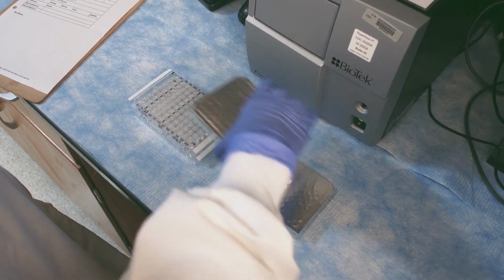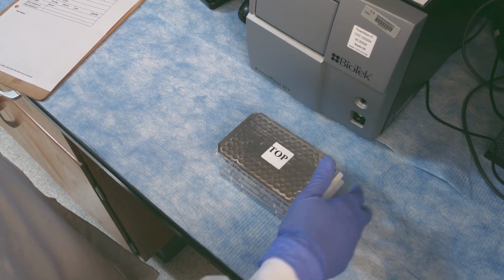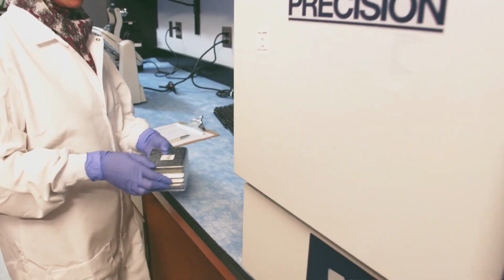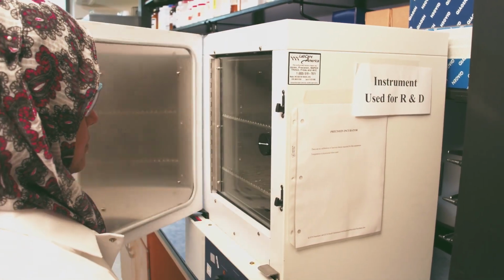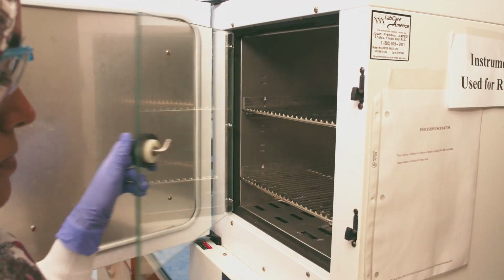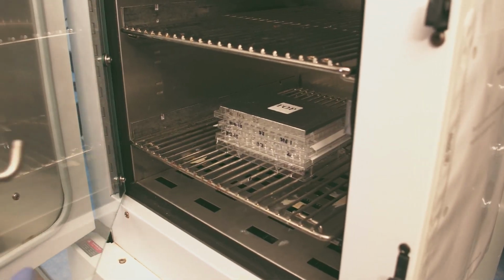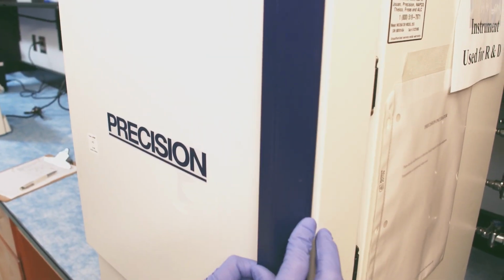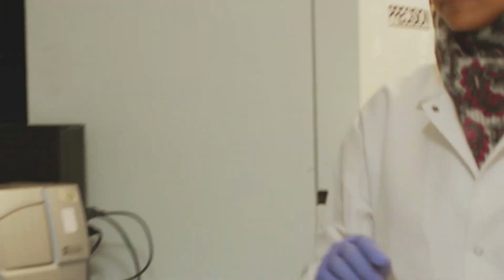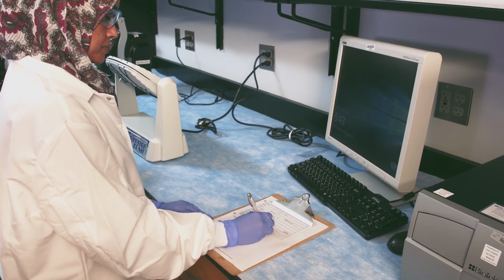Stack the plates and sandwich them in between 2 empty plates. Make sure the temperature in the incubator is within ± 2 degrees Celsius of 37 degrees Celsius, and that the fan works to distribute the heat evenly. Place the plates in the center of the incubator. Keep the plates incubated for approximately 42 hours. Remember to time the start and end of this process carefully so you aren't forced to remove the plates in the middle of the night.